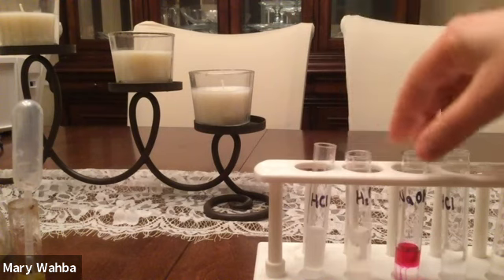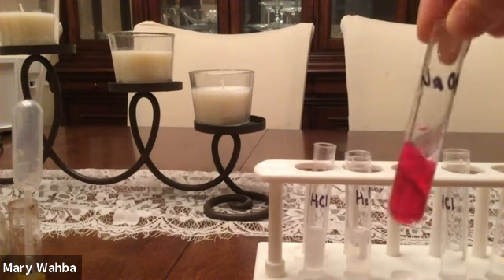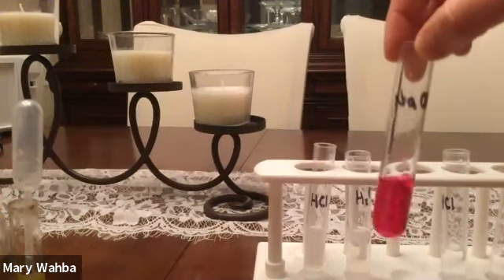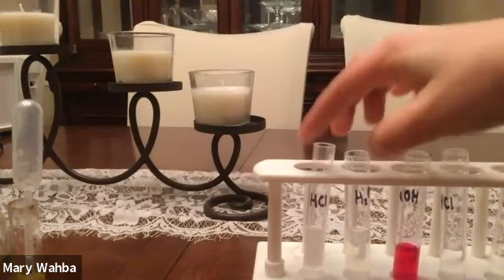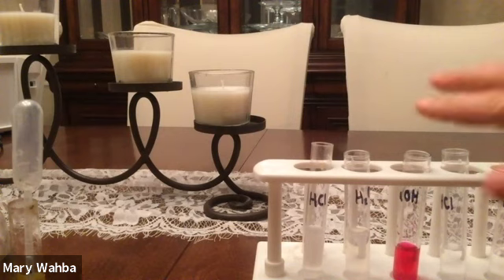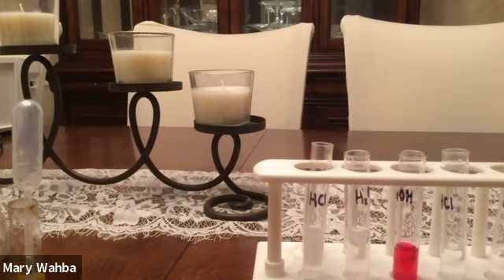But in a base, it turns this bright, pretty fuchsia. So it's pink or fuchsia in a base, but it is colorless in an acid or in a neutral solution. It actually turns this pretty pink color at a pH of 9. The next indicator we're going to use is called methyl orange.